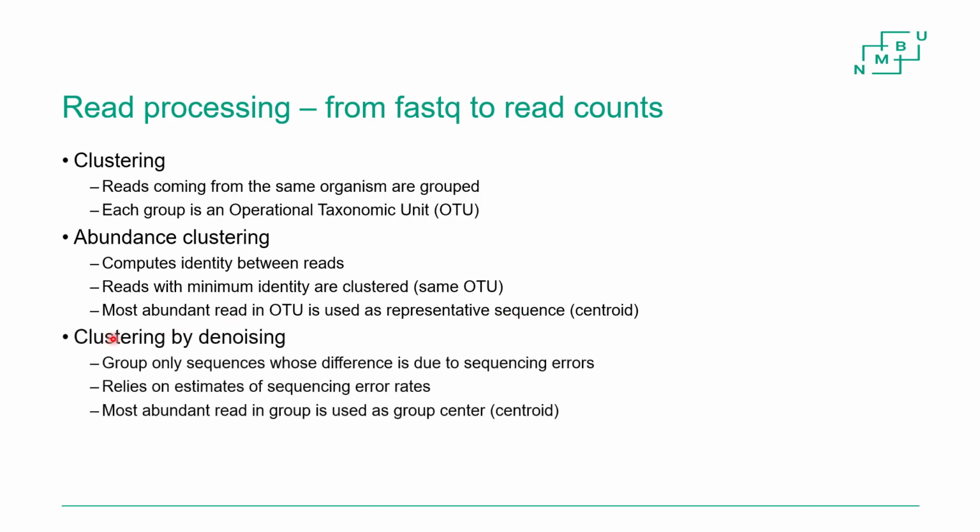The other approach is what we call denoising, which is also a way of clustering, you could say, even if the people behind denoising say it's an alternative to clustering, but that's just a battle of words, right? Because clustering just means grouping. In my eyes, it's not specific to some procedure.